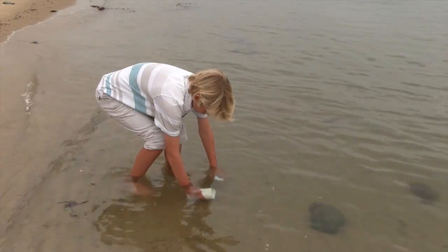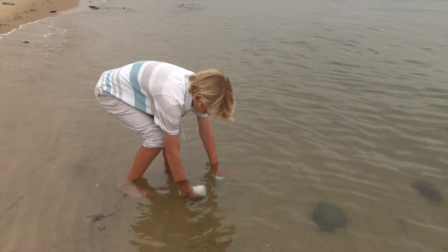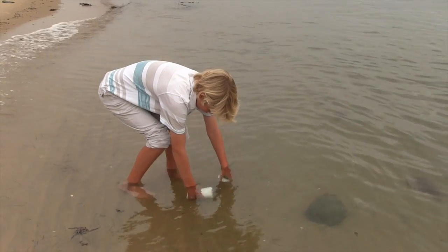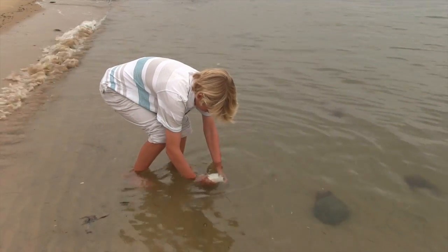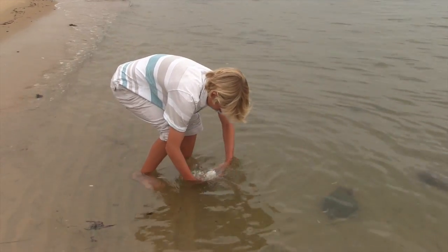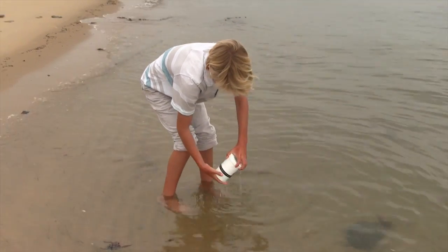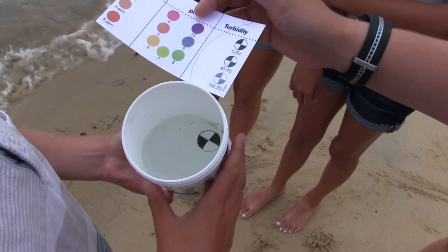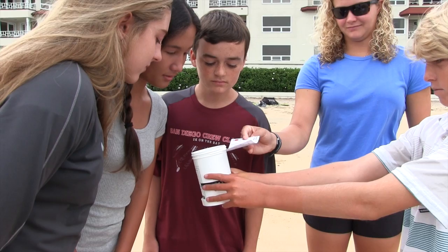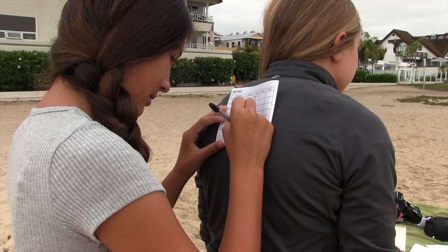To test turbidity, plunge the container below the surface. Turn the jar into the current and allow water to flow into the jar for 30 seconds. Cap the jar while still submerged. Be sure the water level is to the fill line. Hold the turbidity chart near the top of the jar and compare the Secchi disc icon in the jar to the chart and record the result.